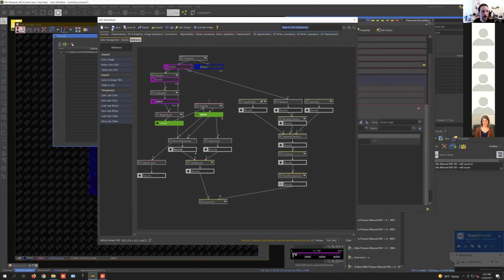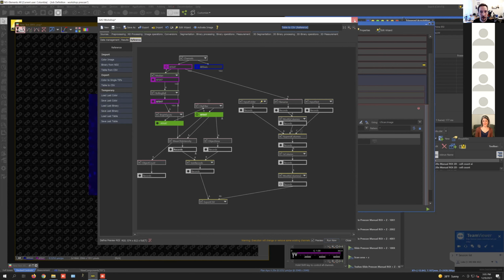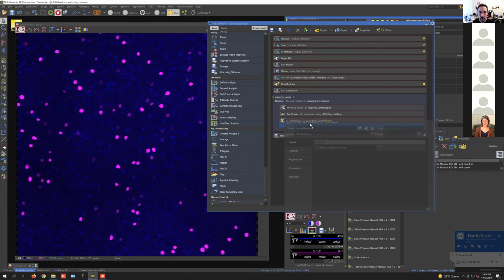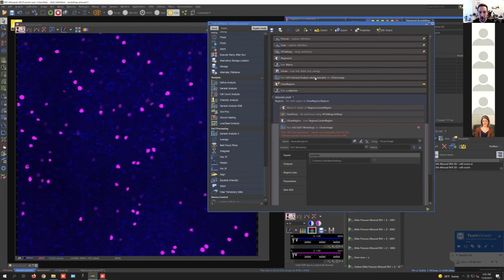It's always a bit risky with live demos, but I think we can get this to work. So what I can do is say, okay, use this. I'm just going to get rid of this one.